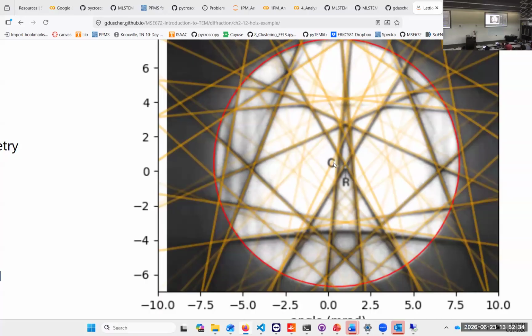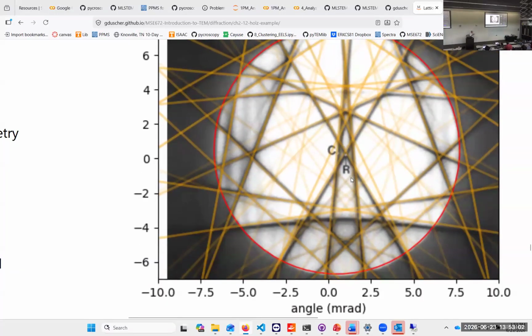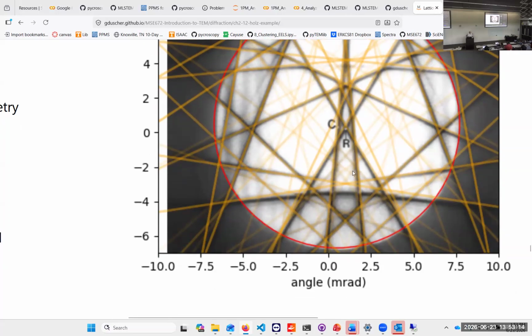The direction of that vector to the nearest point of the line is directly correlated with our G vector, right? So I don't have to do anything else but adjust this distance, and the angle is 90 degrees to it. So I have all of those values already, and I don't need to do a lot of calculations. So all we really need to do is find our mesh of G vectors, see which ones are activated, and then we can do that.